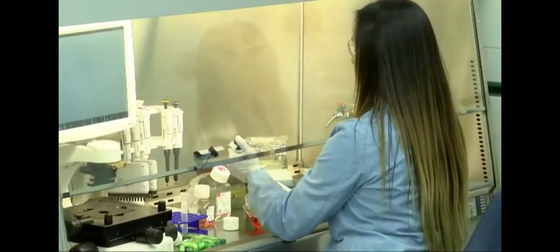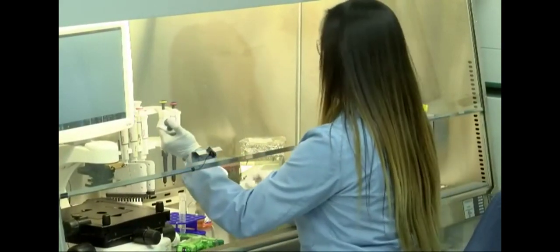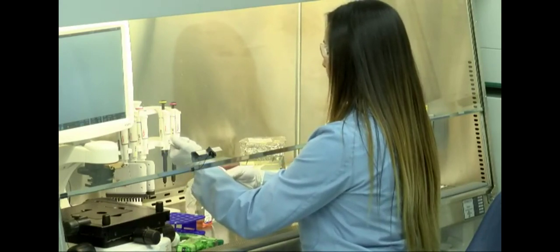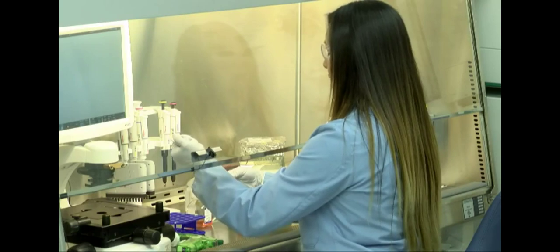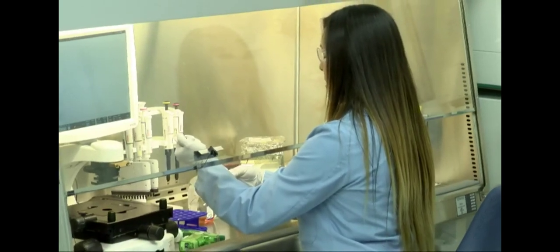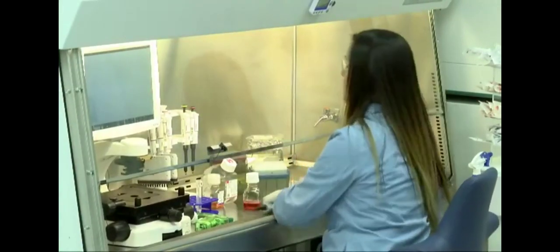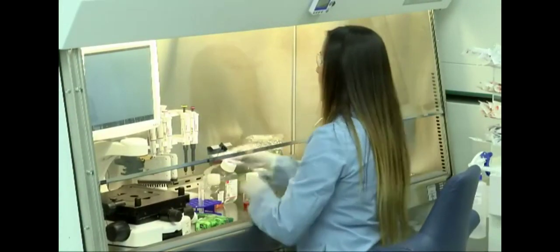And then we're going to actually resuspend in either 1 or 2 mils of our maturation media, depending on how many cells we have. So I'm just going to use 1 mil right now. Make sure you pipette up and down so that those cells are still singularized and evenly distributed in this media. And then we're actually going to count our cells.